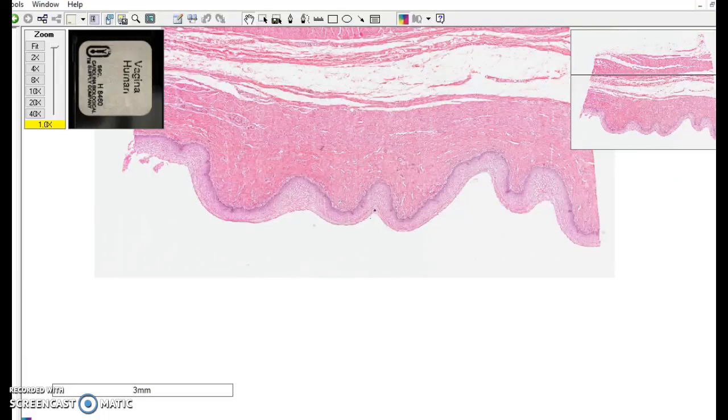Stratified squamous epithelium, non-keratinized. It's found lining the tubes in the body that reach the surface. You'll see it inside the mouth, in the esophagus, in the anus, and here you can see it in the vagina.